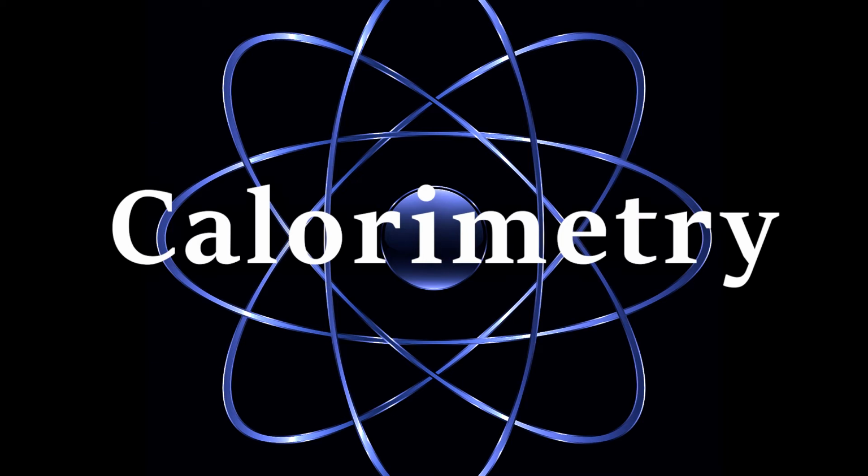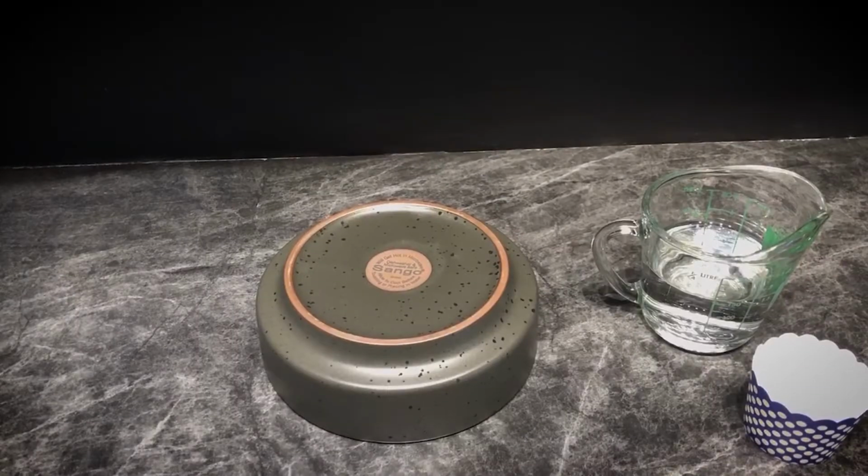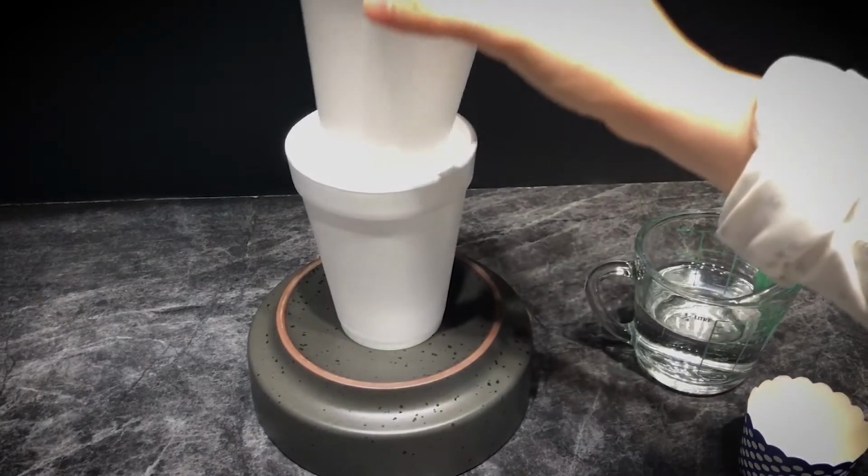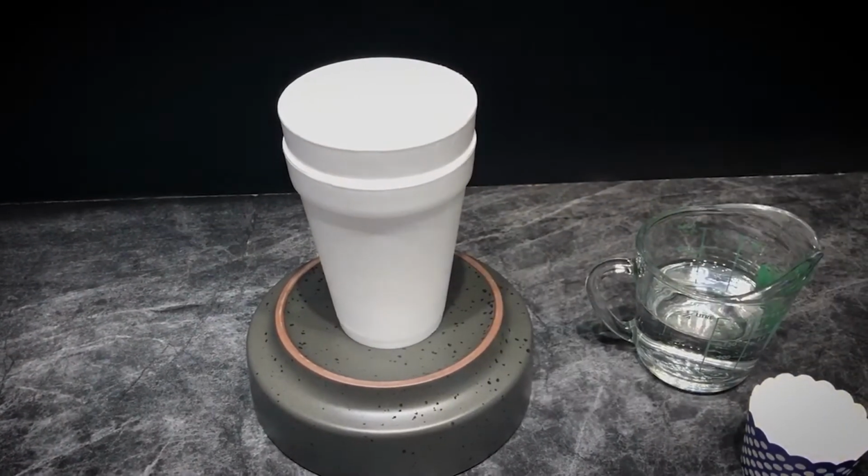Calorimetry is the process of measuring the amount of heat released or absorbed during a chemical reaction. Put a magnetic plate in the experiment area. Place 2 styrofoam cups nestled inside of each other on top of the plate.